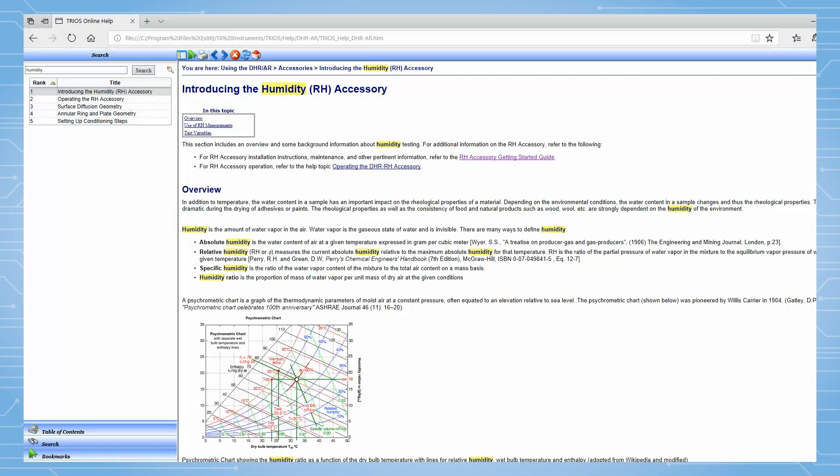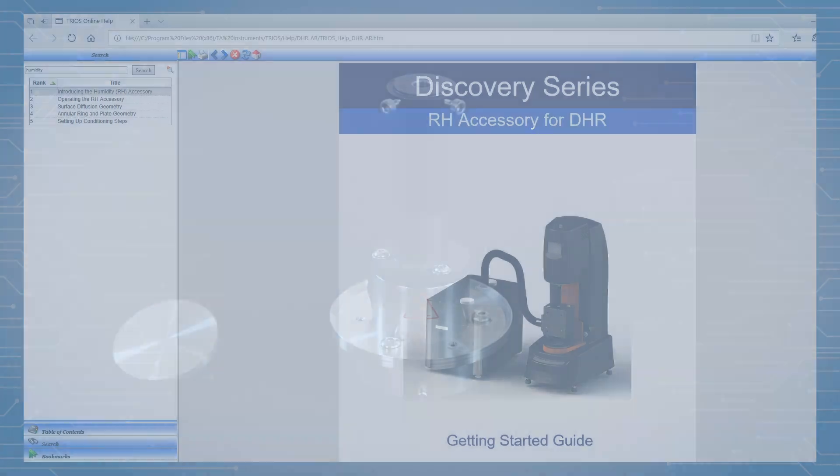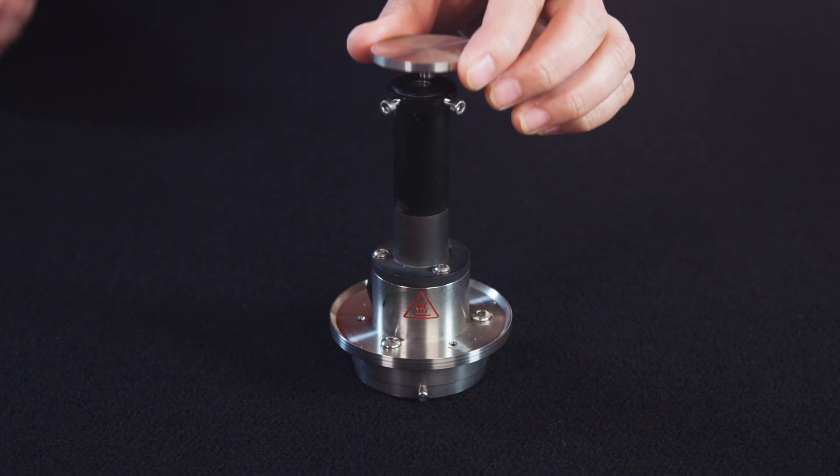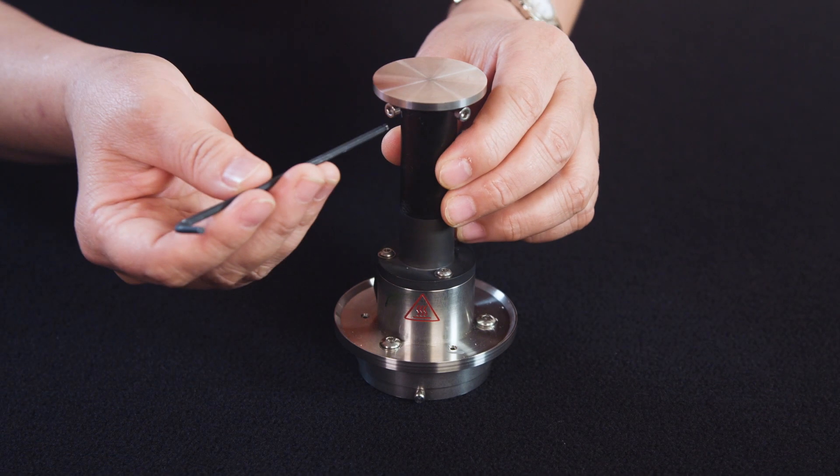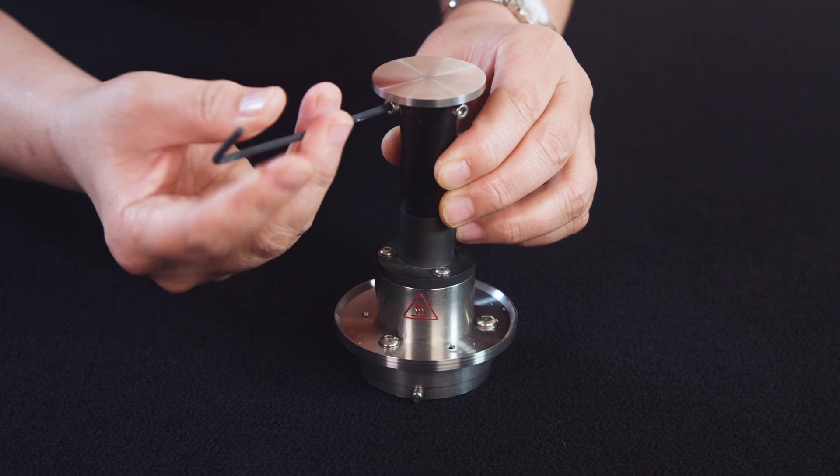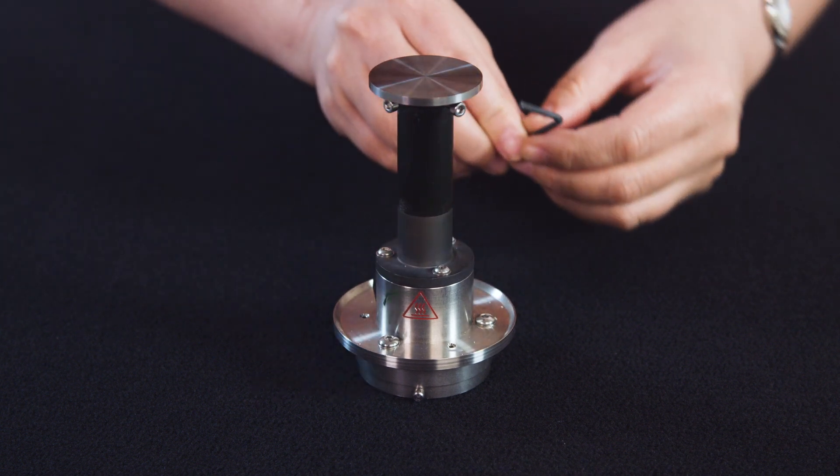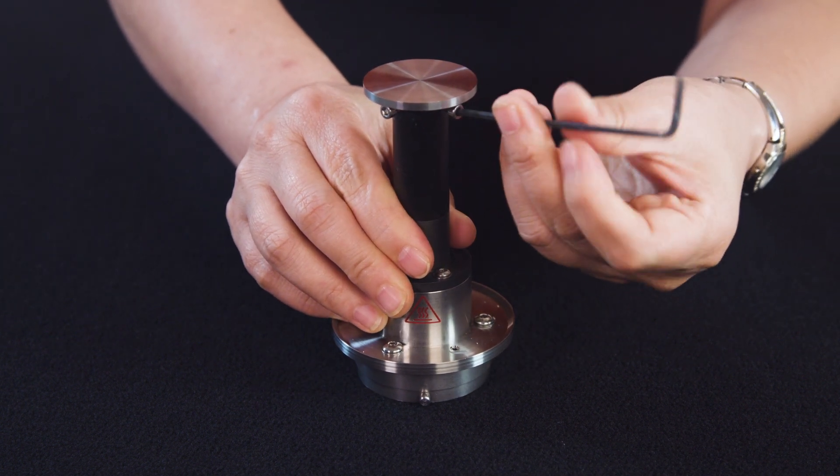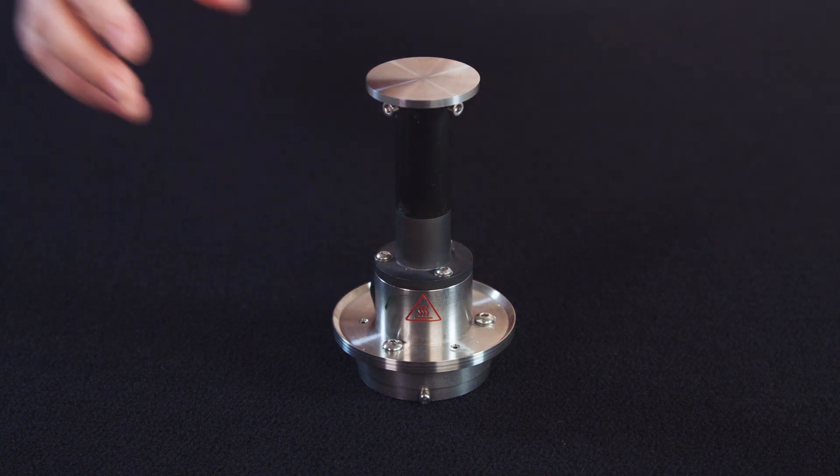Please follow the DHR-RH Getting Started Guide Manual and the RH Accessories Setup Tech Tip to properly install the humidity generator and humidity chamber. First, insert the 40mm or 50mm disposable plate to the bottom geometry stage. Tighten the screws using the Allen key.